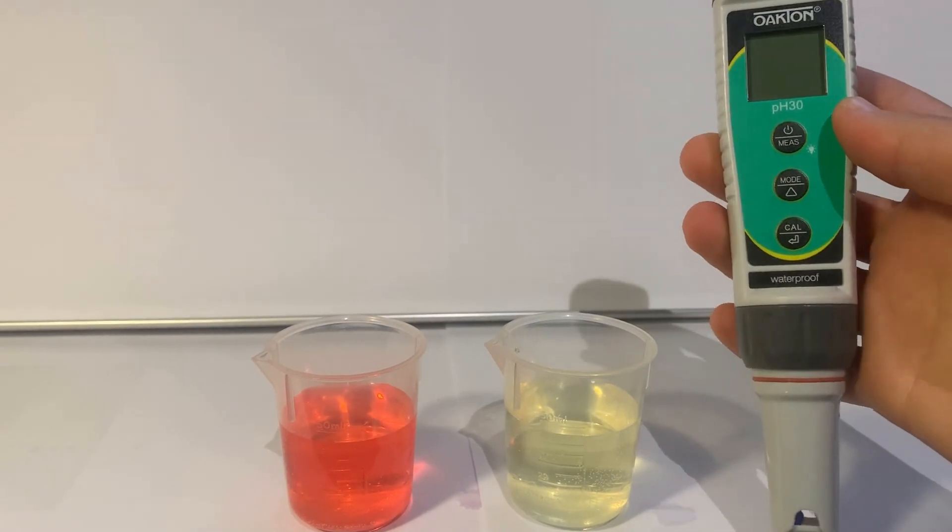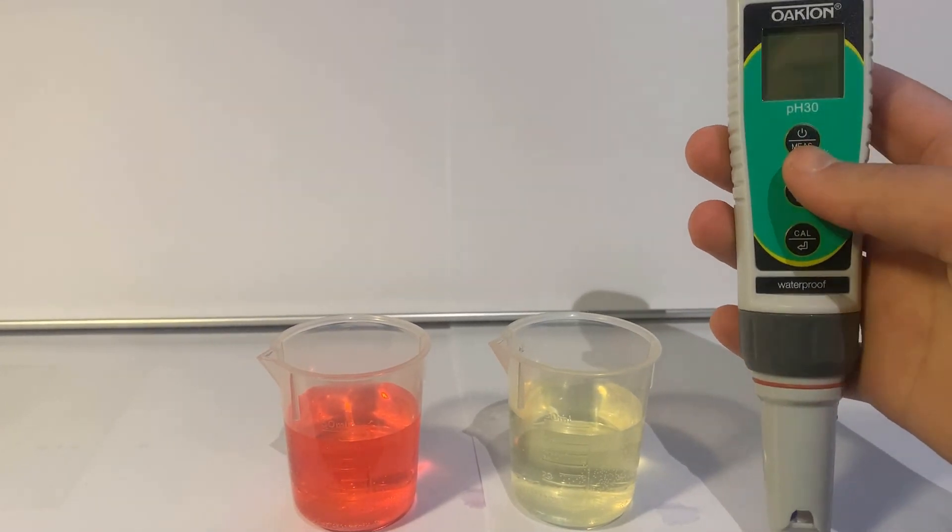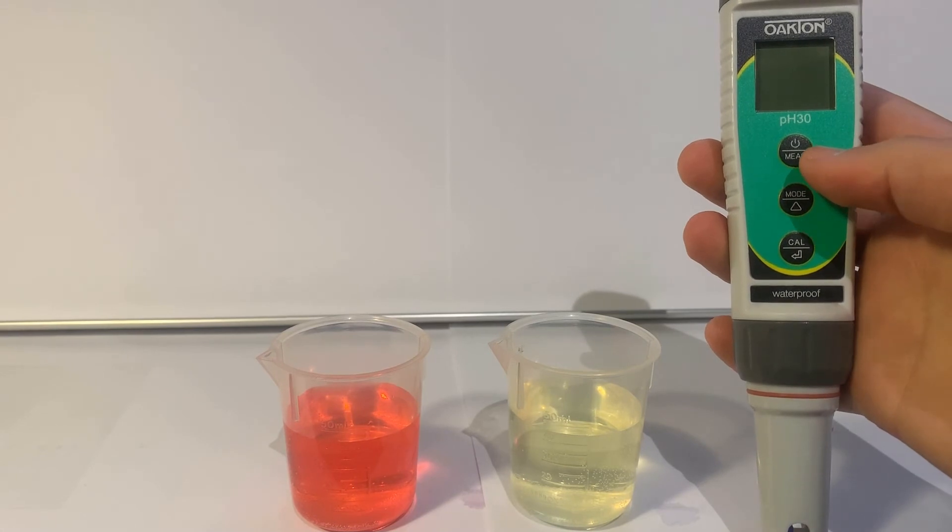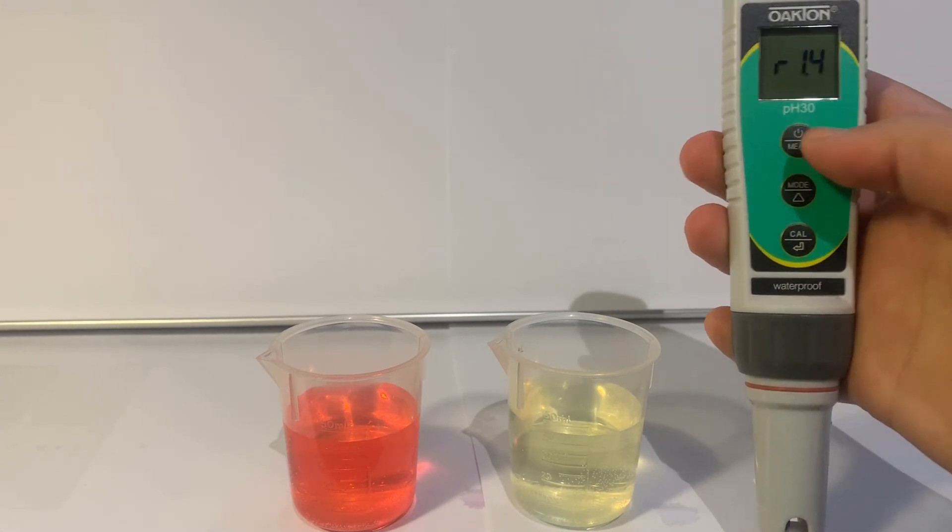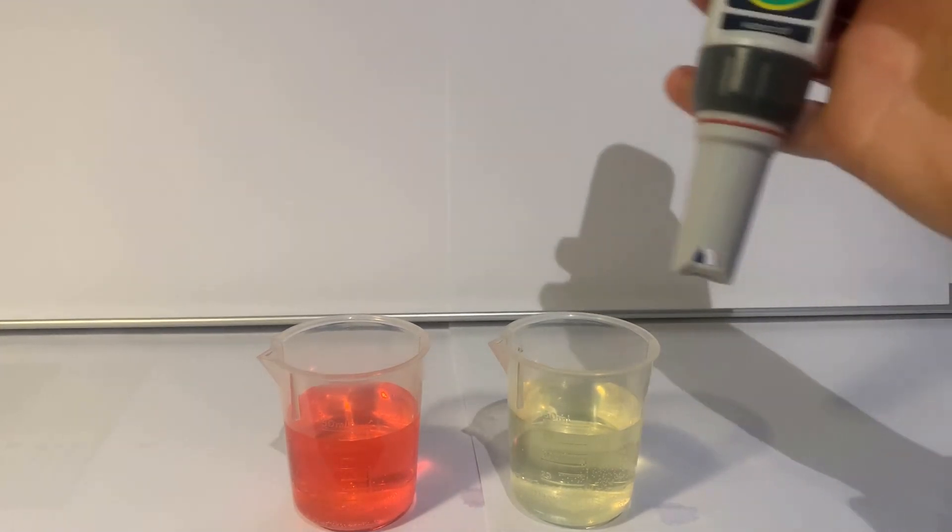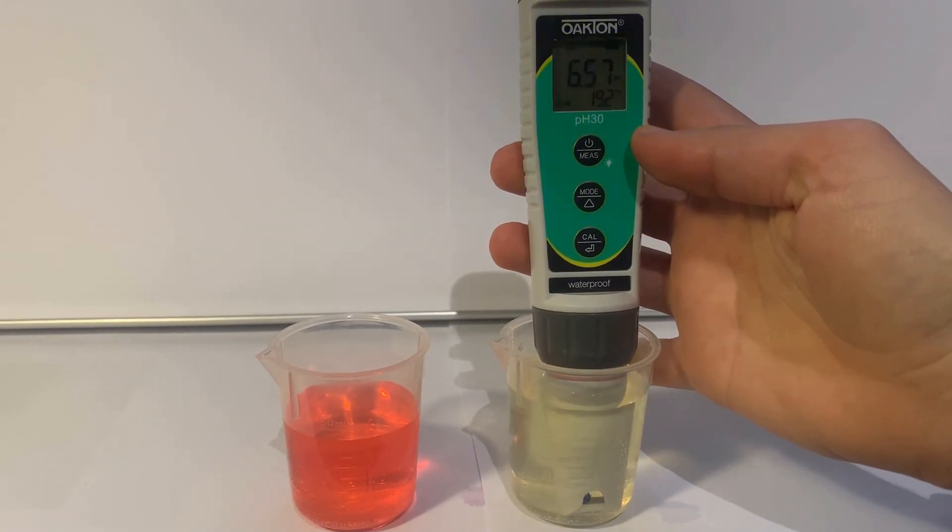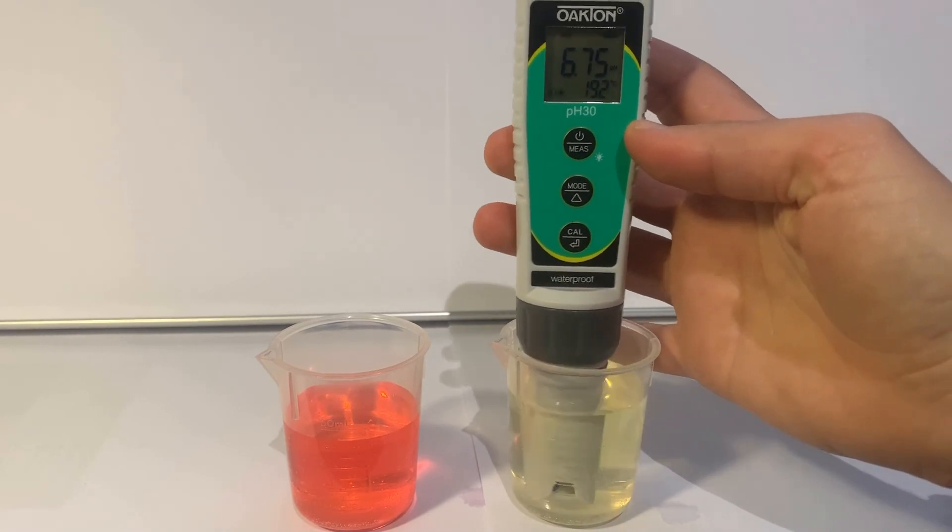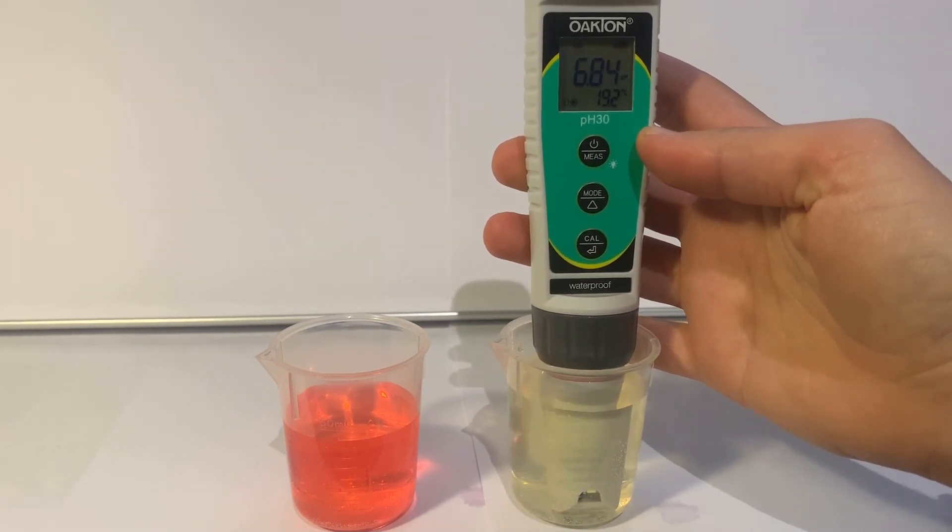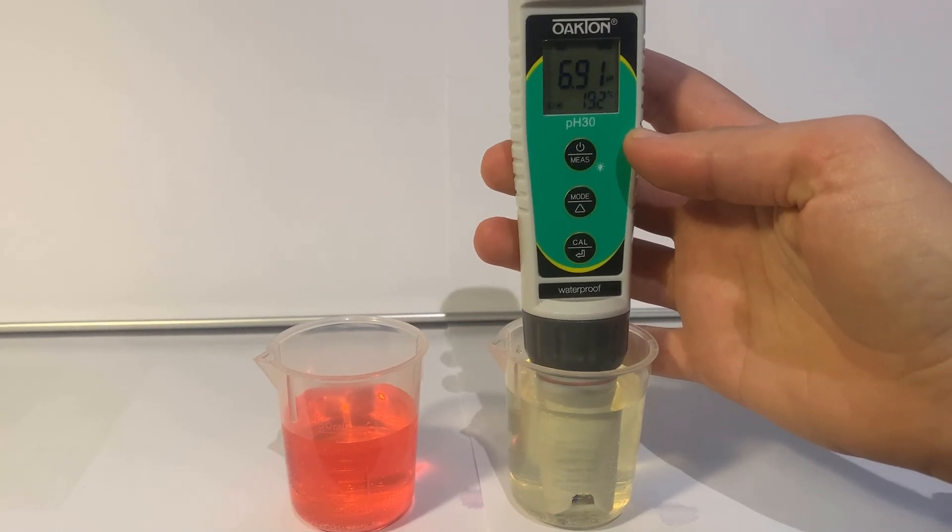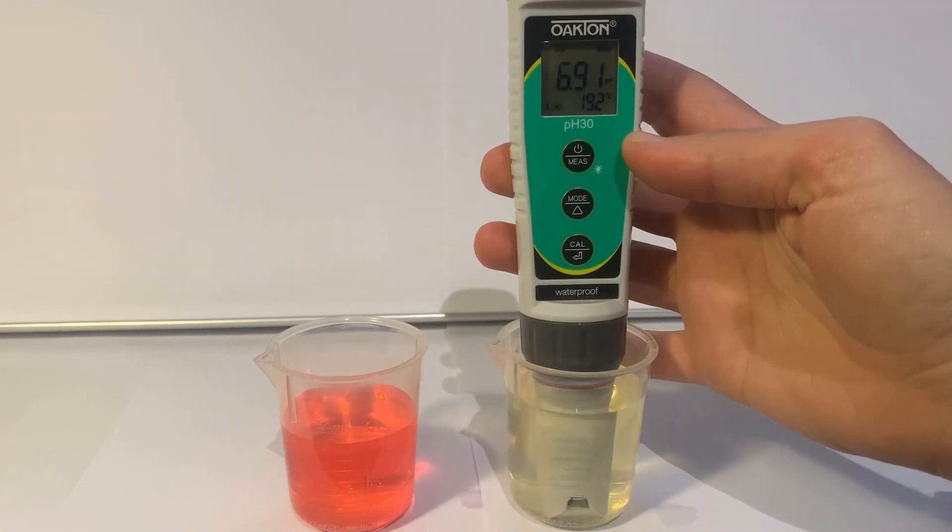When you return from the field, we want to ensure that no probe drift has occurred, so we'll check this by taking measurements of our calibration solutions. Turn on your meter and place it into Buffer 7 solution. We are not entering calibrations here, just taking a reading. Allow the stabilization icon to appear, then record your temperature and pH reading on your data sheet.